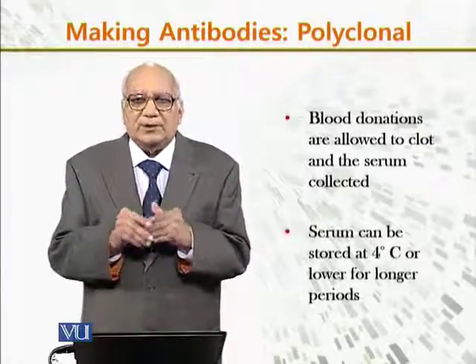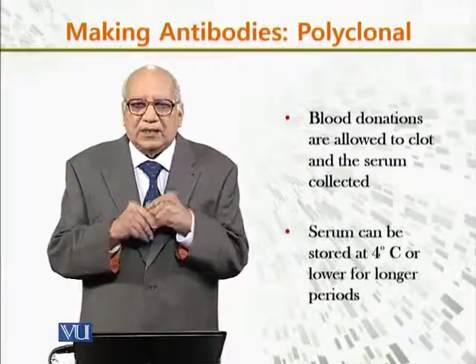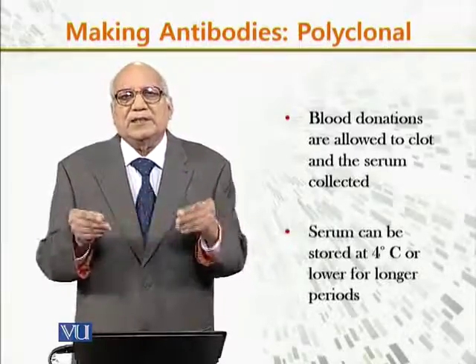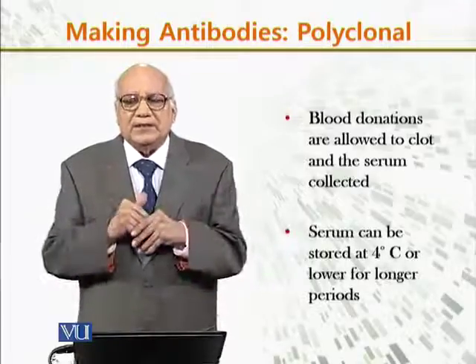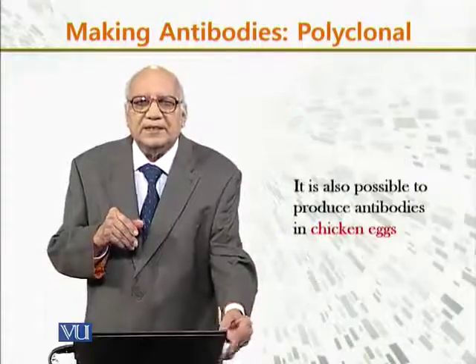Then the serum can be stored at 4 degrees centigrade, or at lower temperature for a longer period. If you want to keep it for a longer period, then you have to store it at low temperature.